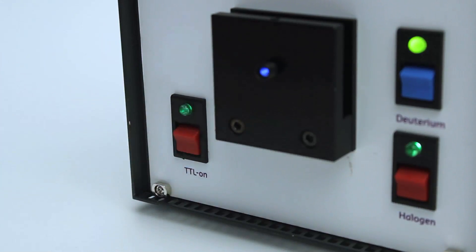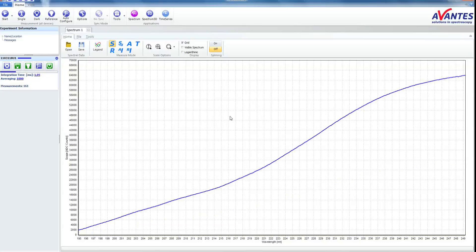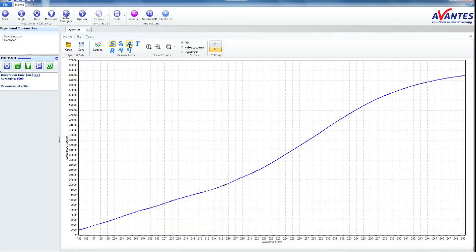Switch on the light source. To measure in absorbance mode, please click the button labeled A. You will see the spectrum around the zero line.